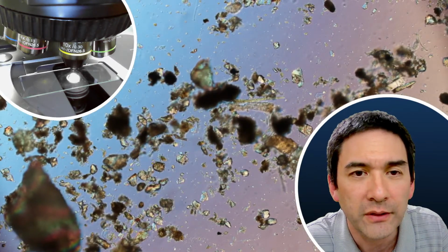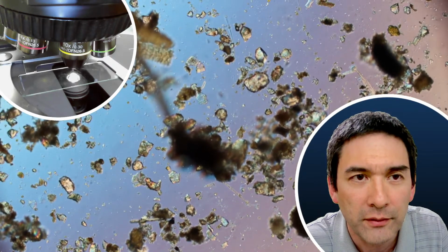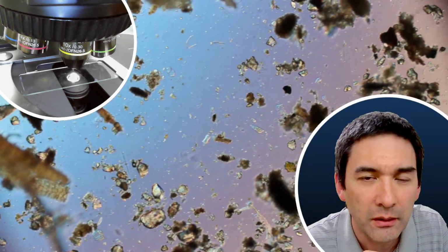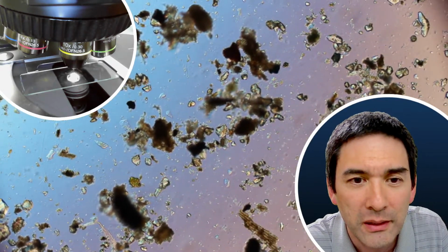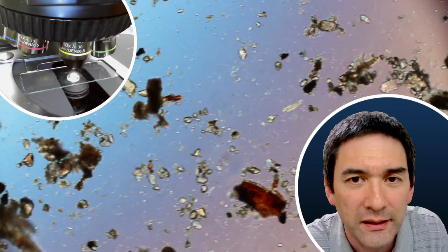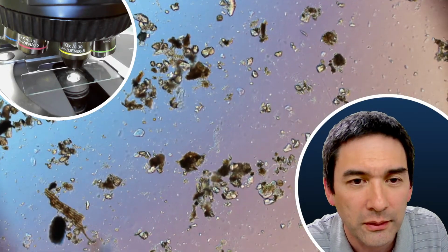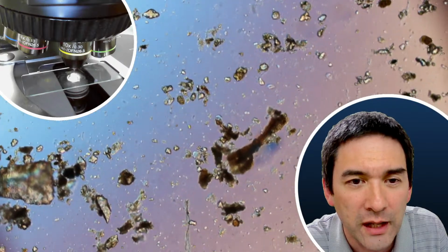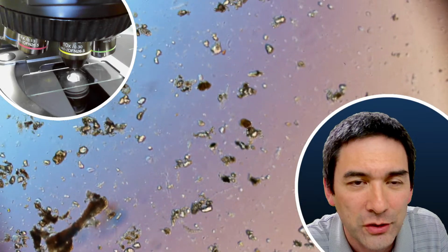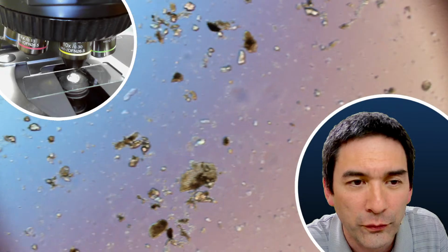And this is basically what I did in the afternoon. I found a few tardigrades, and I put a cover glass on top, and I prepared everything for the live stream. Then I didn't pay attention, and it started to move around on my microscope slide, and I did not pay attention for a couple of minutes. And then it walked off somewhere, and I couldn't find it anymore. Even though I was looking for it for, I don't know, 10-15 minutes before I started the live stream, I couldn't find it anymore. So I quickly prepared a couple of other samples, just like I've done now. But they are essentially a challenge to find.